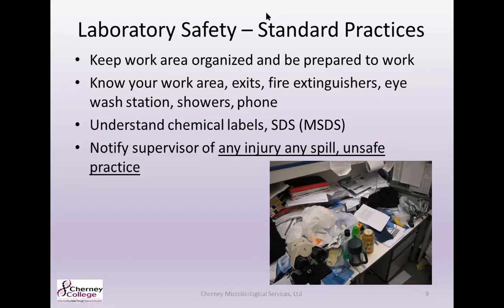Make sure that you understand chemical labels and SDSs, which were previously known as MSDSs, and make sure that you notify your supervisor of any spill or any unsafe practices. And also regarding SDSs, make sure that you and your lab techs know where to find those SDS sheets within your lab. Do you keep paper copies? Are they electronic? Just make sure that if you have a spill, people know where to locate those materials should they need to reference them for cleanup.